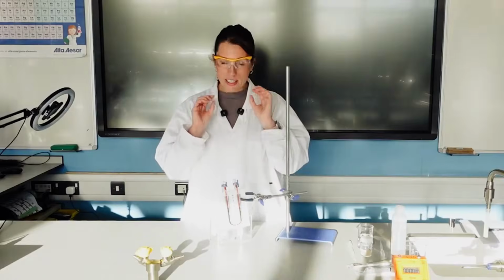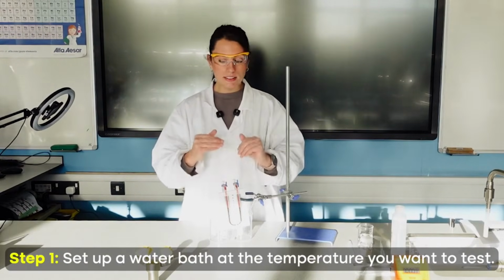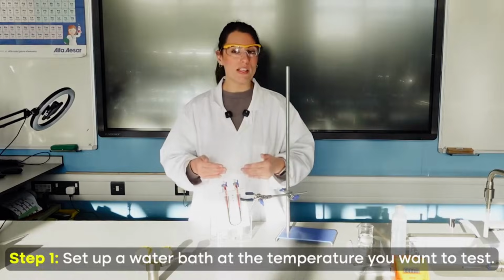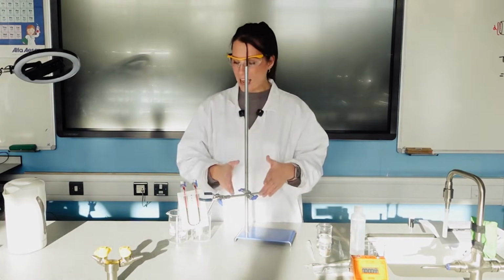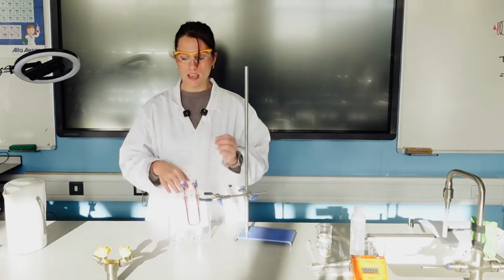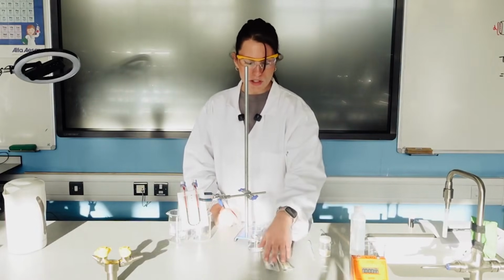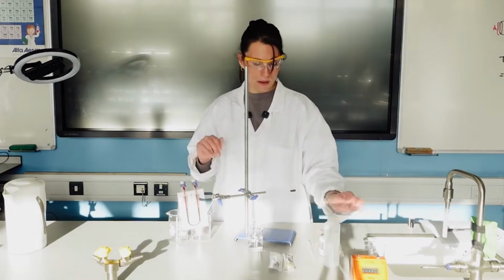We have got our yeast already measured out, the soda lime in both sides. Next, I'm going to set up my water bath. And I'm going to go for 37 degrees C because that's going to be the optimum temperature for the rate of respiration, and we want this to work. So the equipment then, we've talked about the clamp stand, the clamp, we've got our respirometer, 2 boiling tubes, 2 beakers, thermometer. We've got our yeast, soda lime. I've also got here my glucose solution, a stop clock, and I've got syringes to be able to add our distilled water and glucose solutions to the appropriate tubes.